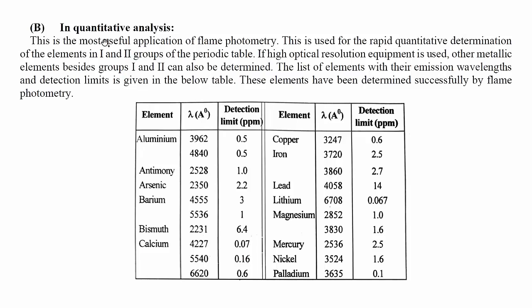B. In quantitative analysis. This is the most useful application of flame photometry.